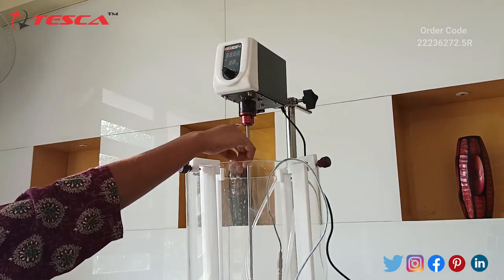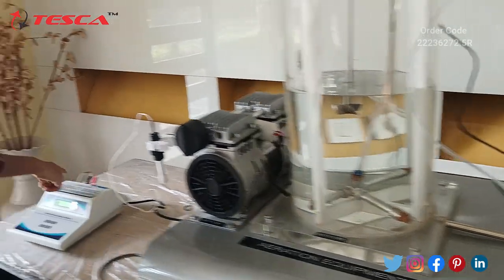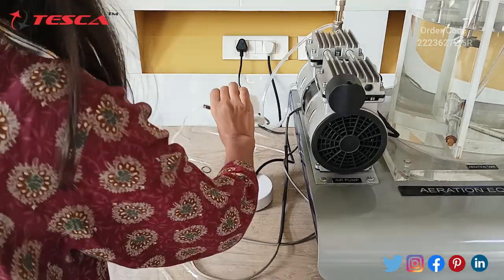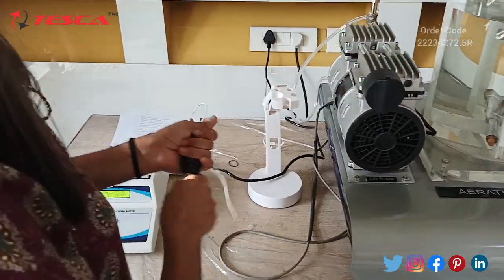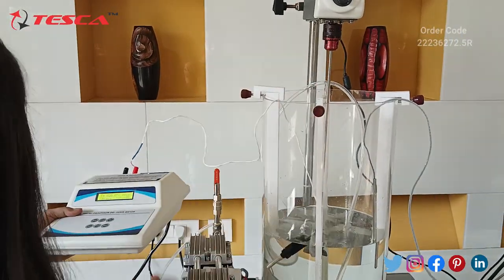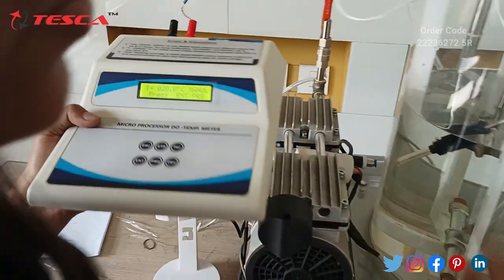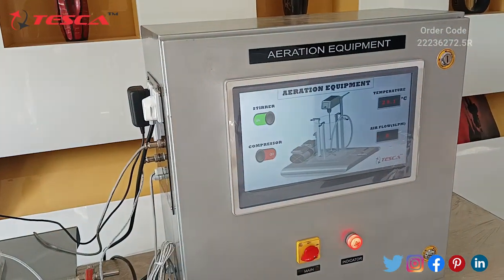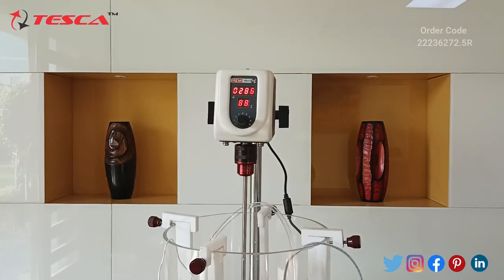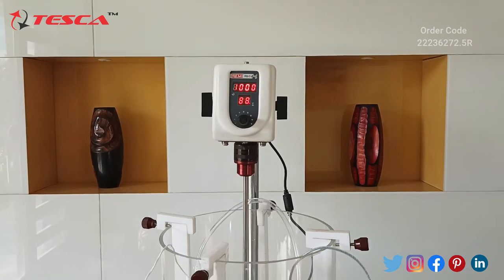From here we can control the RPM of the stirrer. This is our tank and this is our air pump. We have this oxygen level probe which we have to place it in the water. Now we have to turn on the stirrer and set the RPM. Let's set the RPM at 1000 RPM.